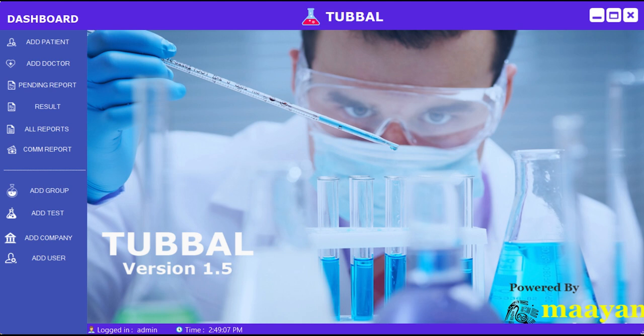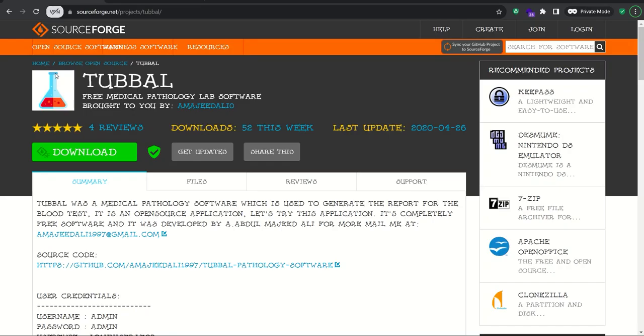In recent days I got so many emails and comments from users who downloaded my software and don't know how to install the database. So in this video we will see how to install this. Let's get in. Alright, let's start from the beginning.